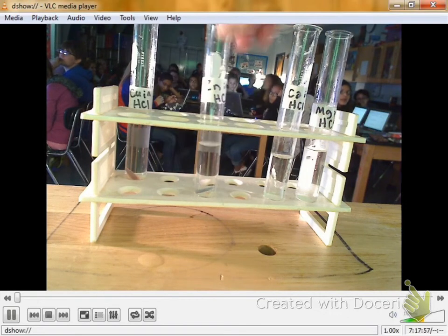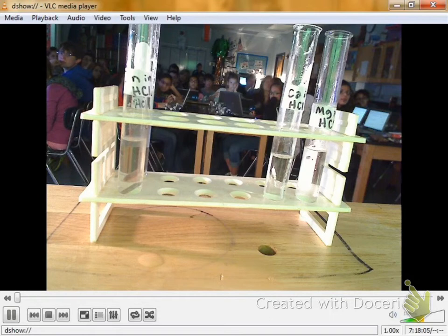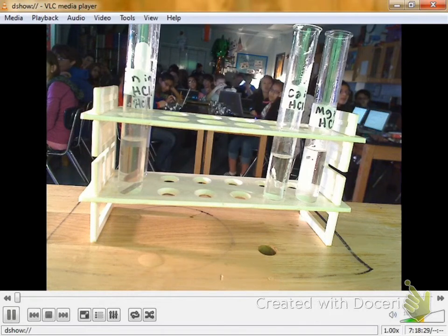All right, I'm going to put these off to the side. Now, they are reacting with the hydrochloric acid. They're just reacting very slowly. As a matter of fact, since y'all are 7th period, I'm not going to empty out the test tubes after 7th period today. I'm just going to leave them in the rack and we'll watch this for the next few days. Copper will probably dissolve in about 2 to 3 days. This is how long it typically takes. And honestly, I don't know how long it takes the zinc. I'll check on it, and I'll check on it, and then I'll forget about it, and then I'll check on it again, and I'll look up one day and I'm like, wow, it finally all dissolved. And it always seems to do it on a weekend, too. It will eventually dissolve in the hydrochloric acid.